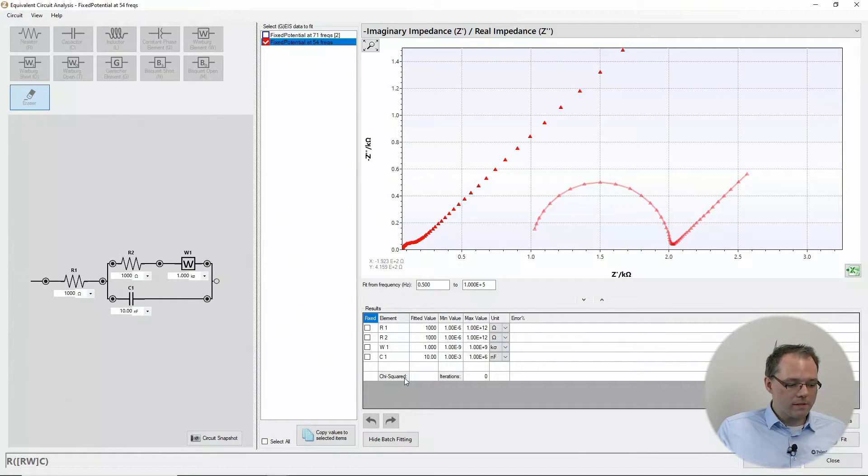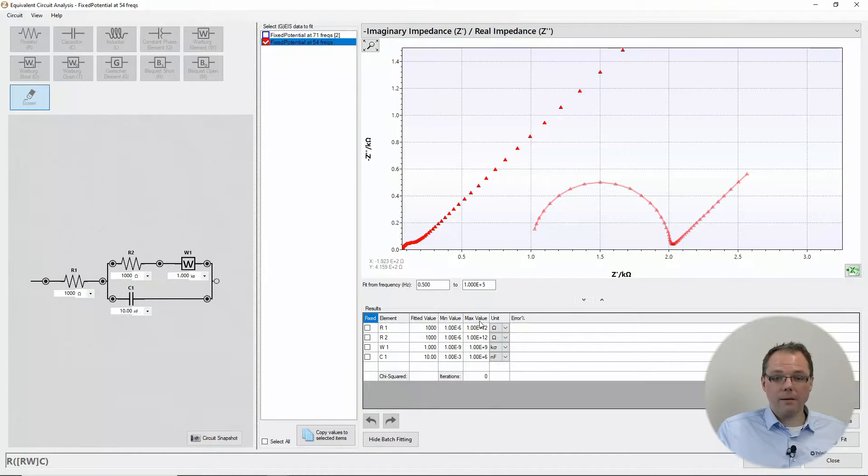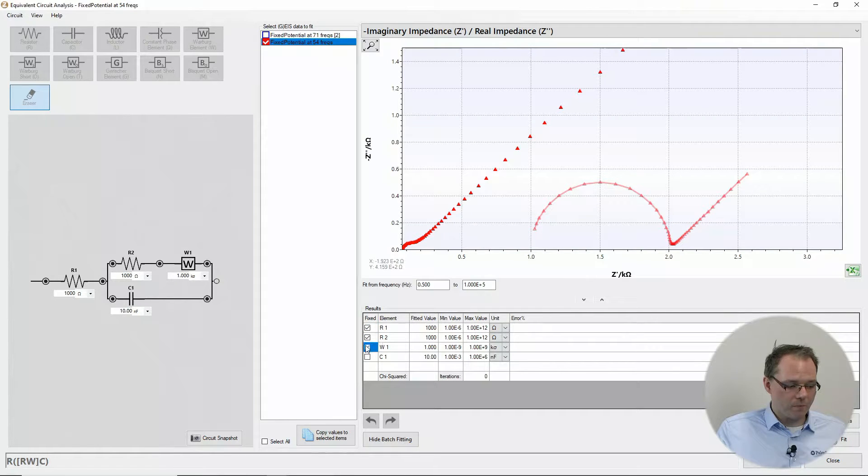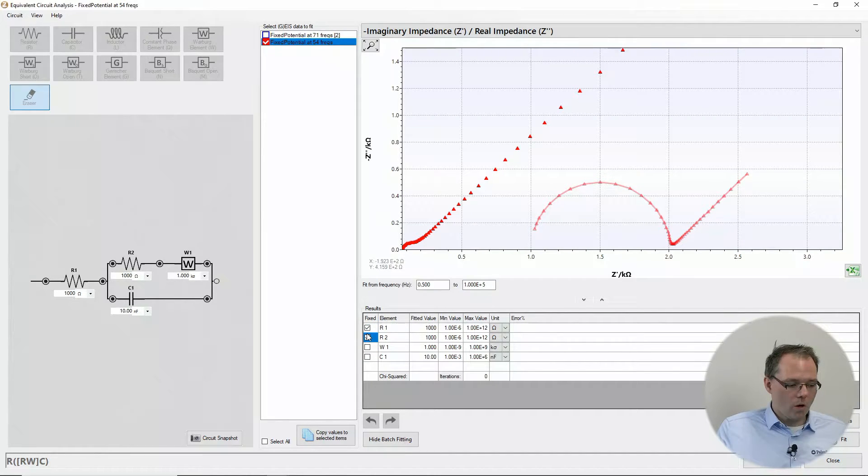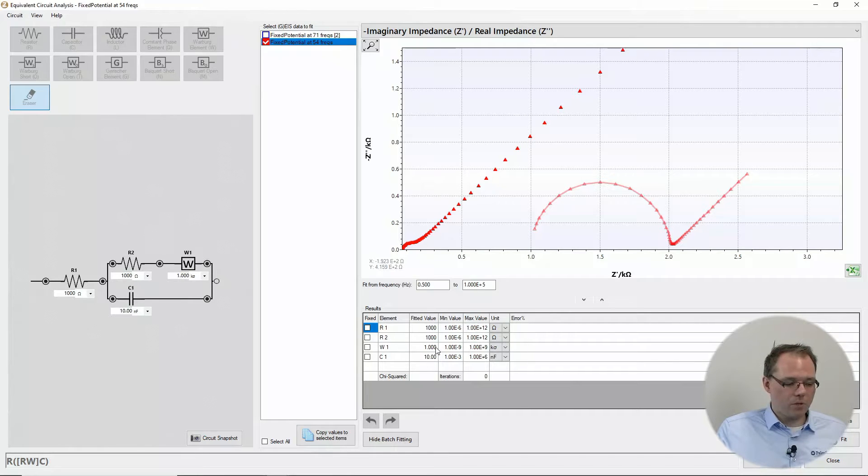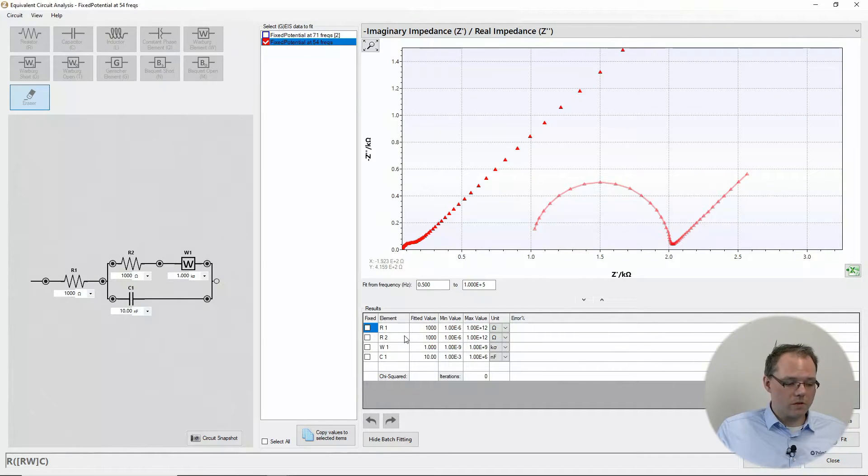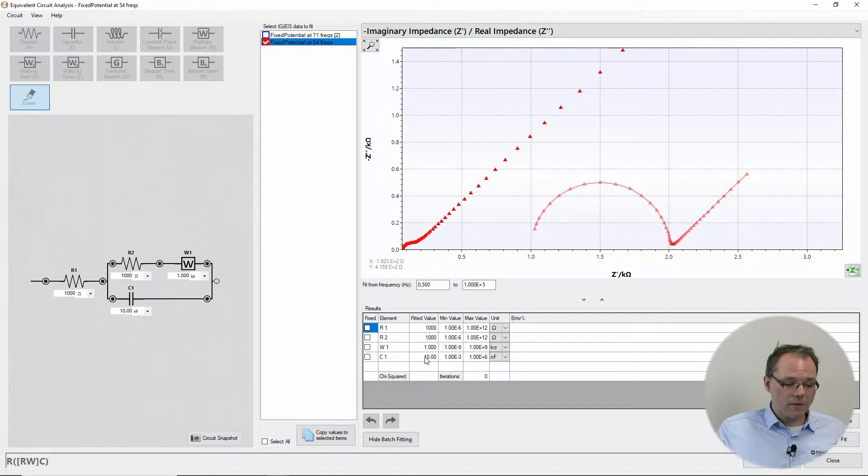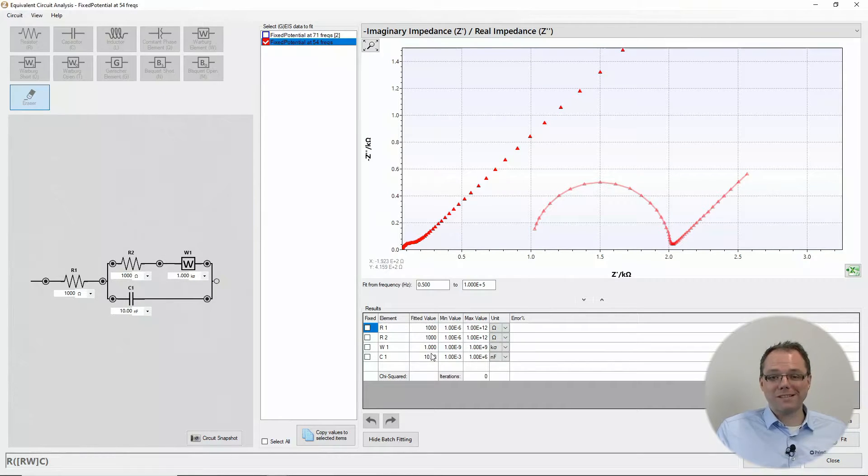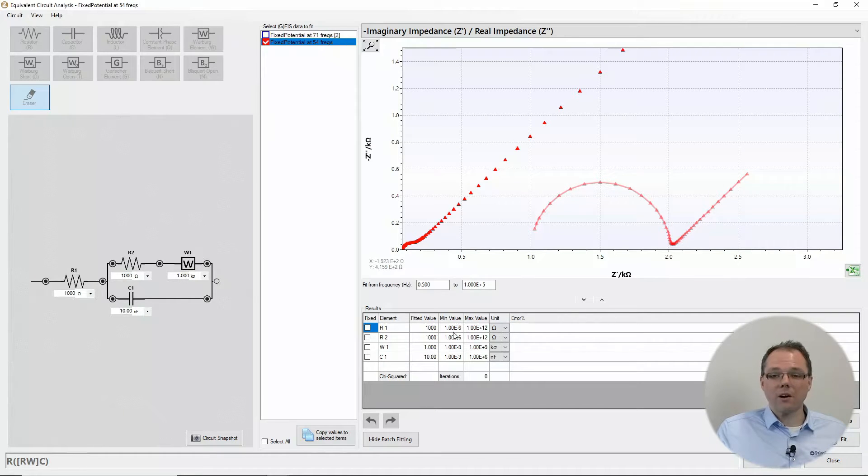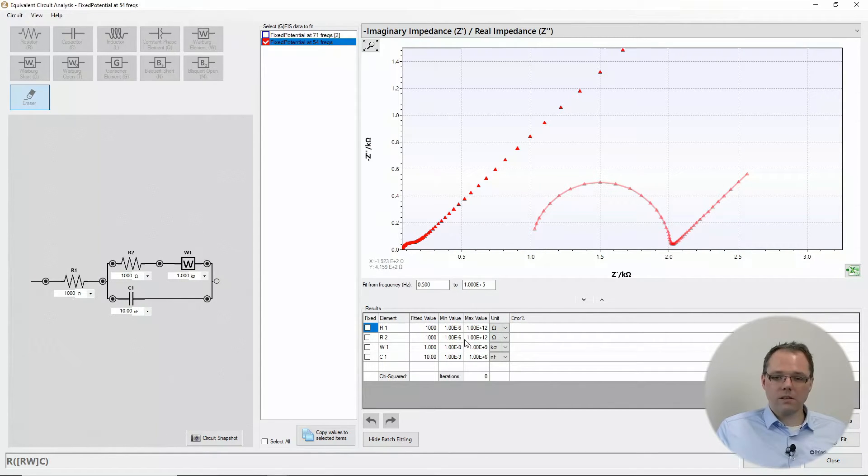You also see the same here as a table where you can set if a component should be fixed, or if it's allowed to be used for fitting. You see the abbreviation used in the circuit, you see the starting value that you use at the start of your fit, and you should see the minimum and maximum values that are allowed in this fitting process.